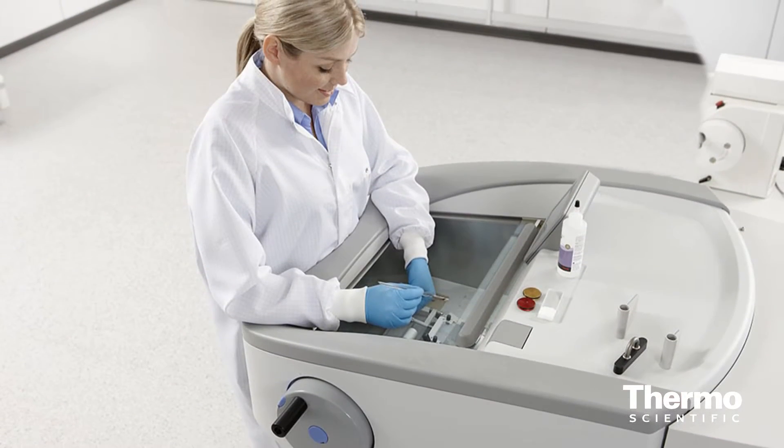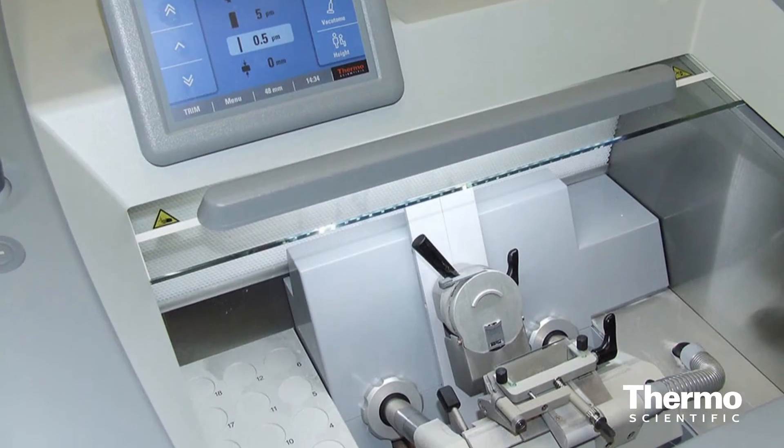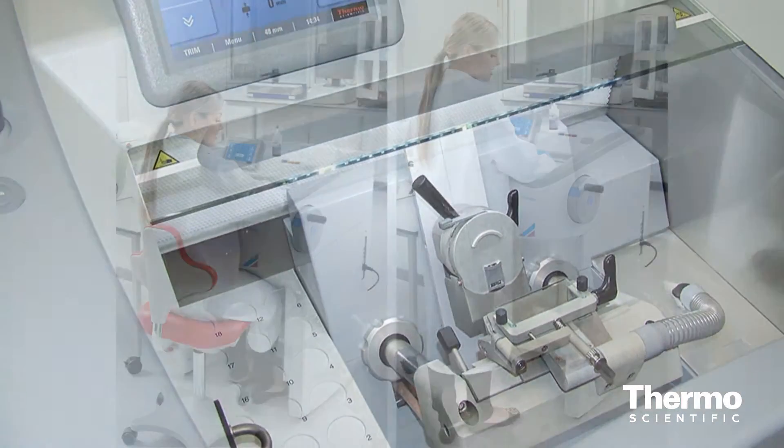What are some of the major features of the NX series that are going to make our customers' lives easier? Ergonomics is really the main thrust of the design of this instrument, and it allows users to comfortably section for hours at a time. It also includes an optional height adjustment so that it can accommodate users of different heights, or people who may prefer cutting while sitting or standing.